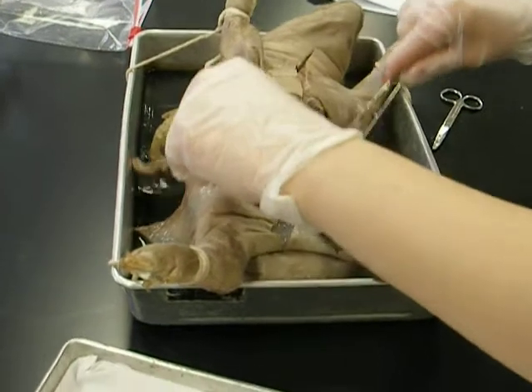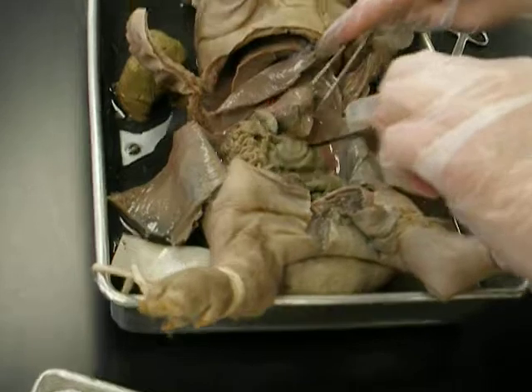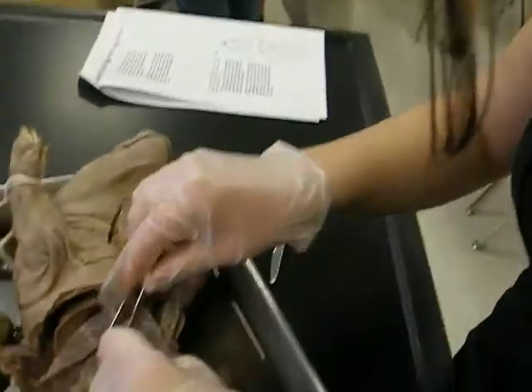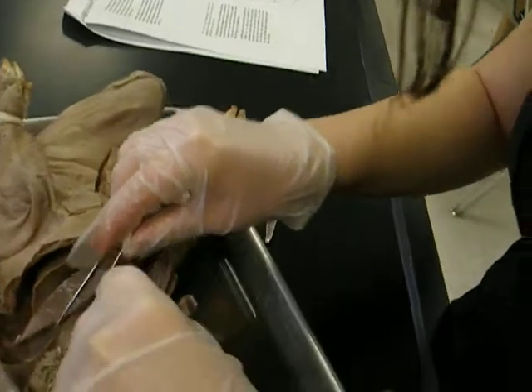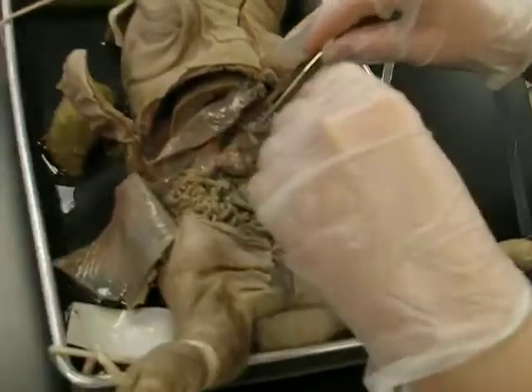Find the junction of the stomach and the esophagus. Where the stomach... Found it. Small intestine. It smells really bad. Cut open the upper surface of the stomach. Cut open the upper surface of the stomach. Upper... What do you mean by upper? The top part. Cut.